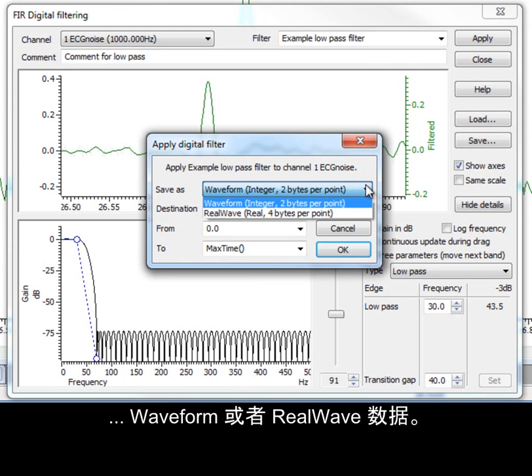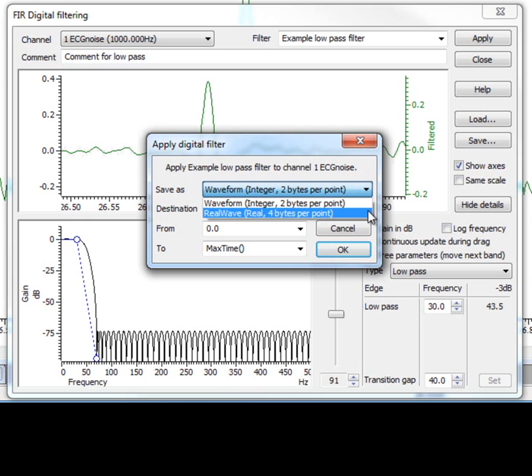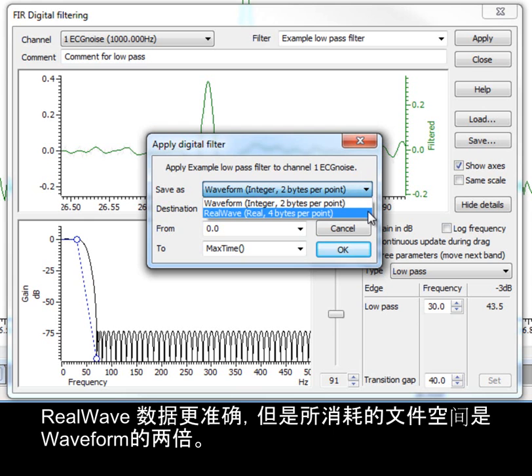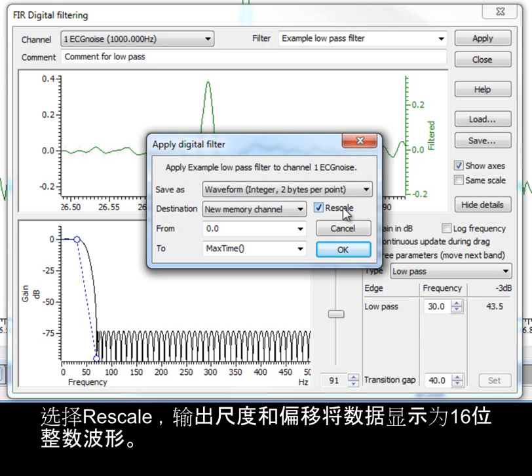As waveform or real wave data. Real wave data gives a more accurate result, but takes up twice as much space in the file. Leaving the rescale box checked sets the output scale and offset to give the best representation of the data as a 16-bit integer waveform.